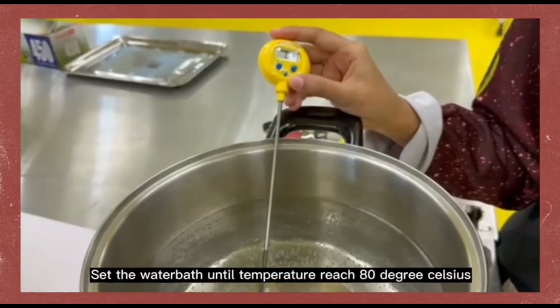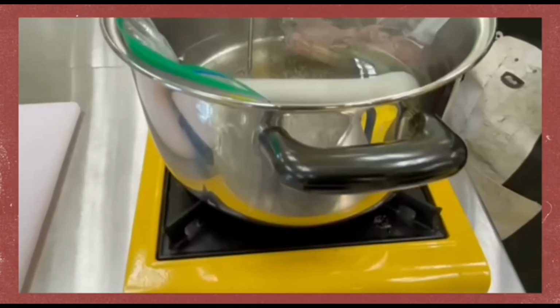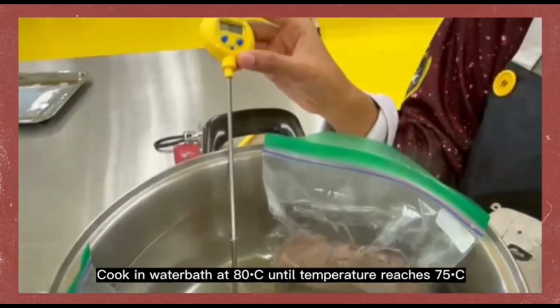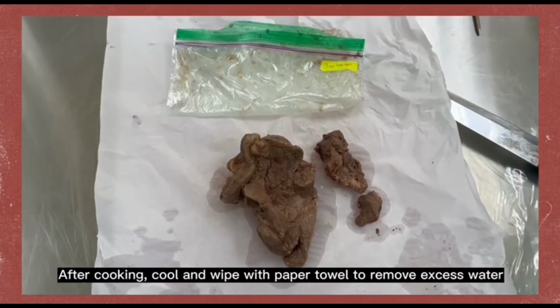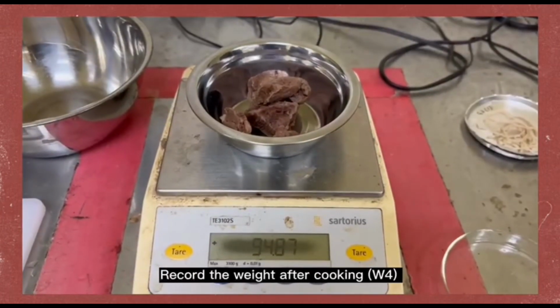Set the water bath until the temperature reaches 80 degrees Celsius. Cook in the water bath at 80 C until the sample temperature reaches 75 C. After cooking, cool and wipe with a paper towel to remove excess water. Record the weight after cooking, W4.